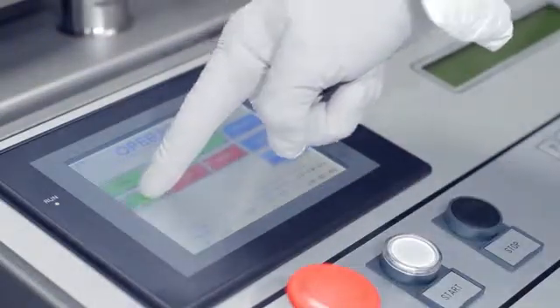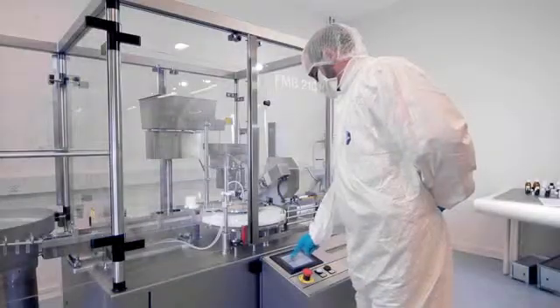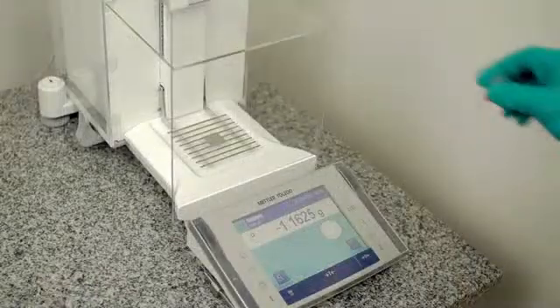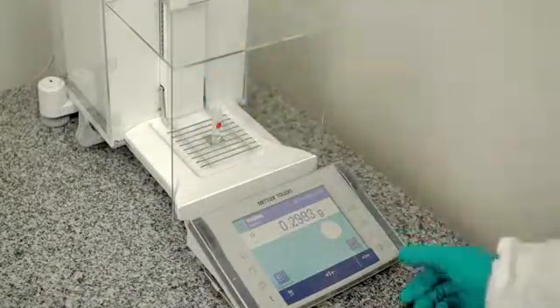An intuitive HMI ensures easy changeover without the need for support from outside the cleanroom. Calibrating the fill volume is easily done and documented using a standard balance connected to the control panel.